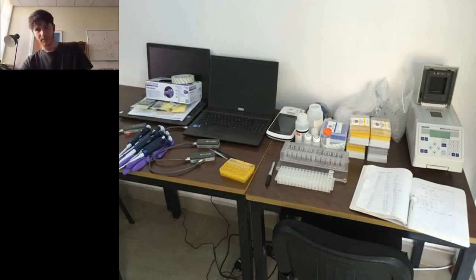But once we had it all set up, the actual equipment that we needed to do this Ebola sequencing was only that much stuff. So not a great deal of stuff. It can fit on 2 tables.